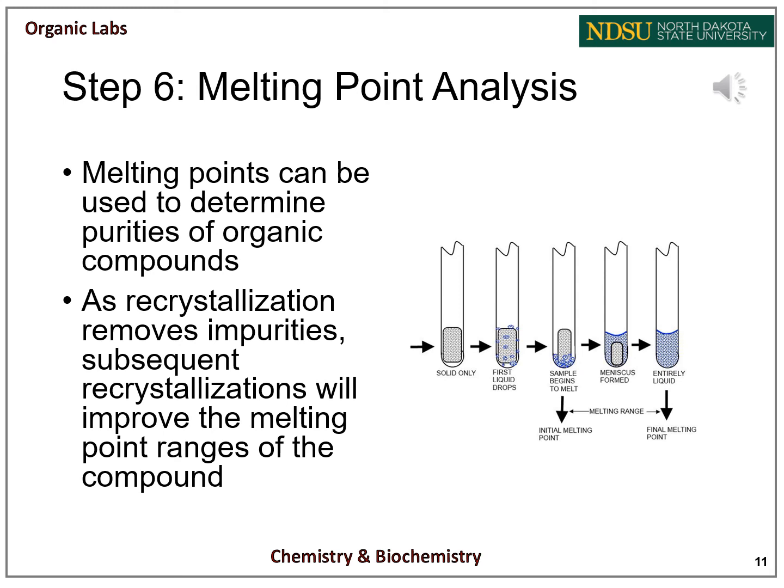And this picture on the right is a reminder of how to correctly choose initial melting points and final melting points for determination of melting point ranges. So that way you can be as accurate as possible during these initial determinations for purity.